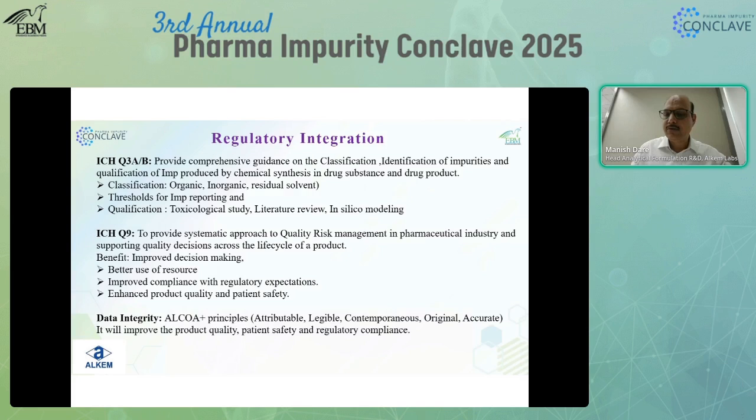As I said, the toxicity is the final database which is going to help us to identify this unknown impurity. And in the complete analysis cycle, we have to follow the ALCOA plus principle, which is giving a complete confidence for the product quality, patient safety, and the regulatory compliance environment for this particular analysis.